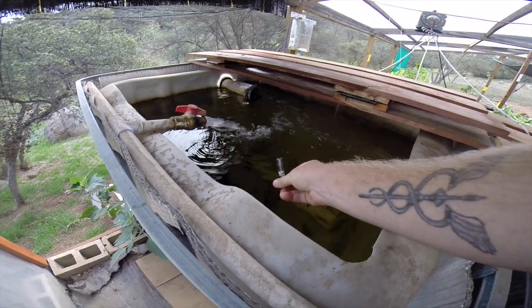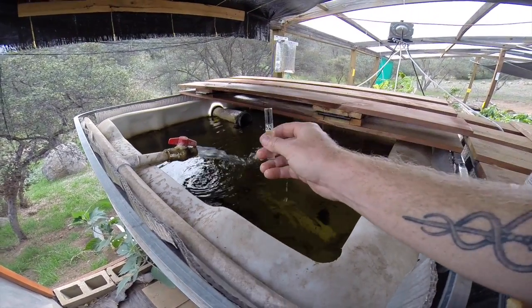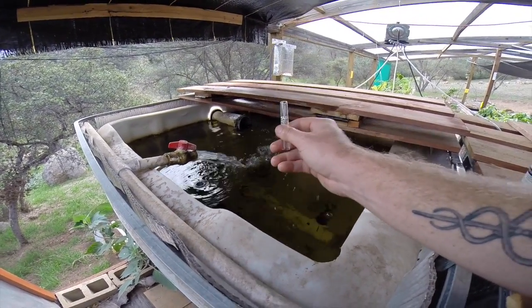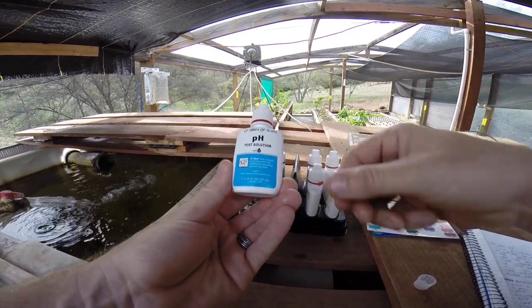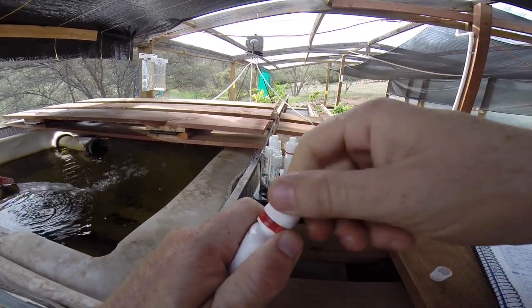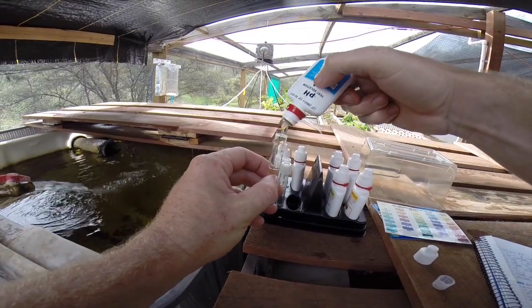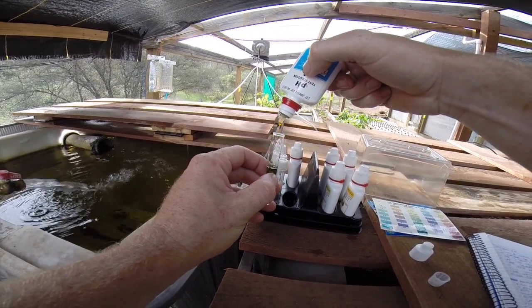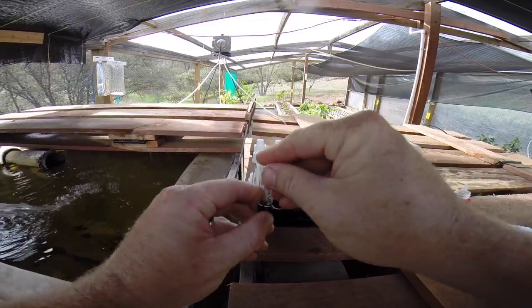We'll start first by checking our pH. I'm going to fill up this test vial to the marked line, which is exactly 5ml. Take your pH testing solution, give it a little shake, then just add three drops into your testing vial. Then just cap the test tube and invert several times.